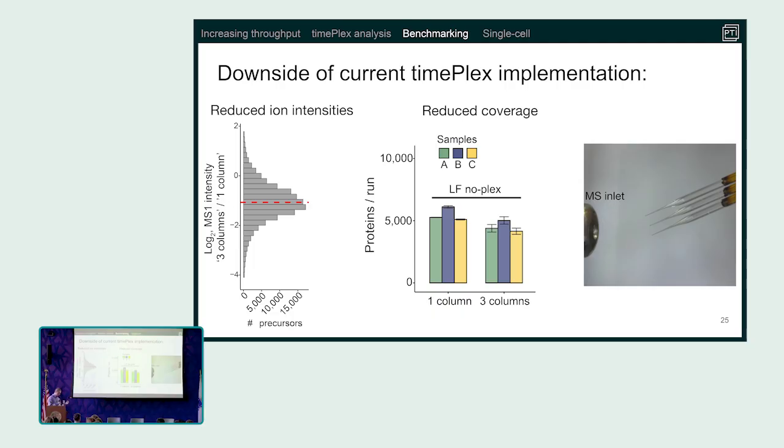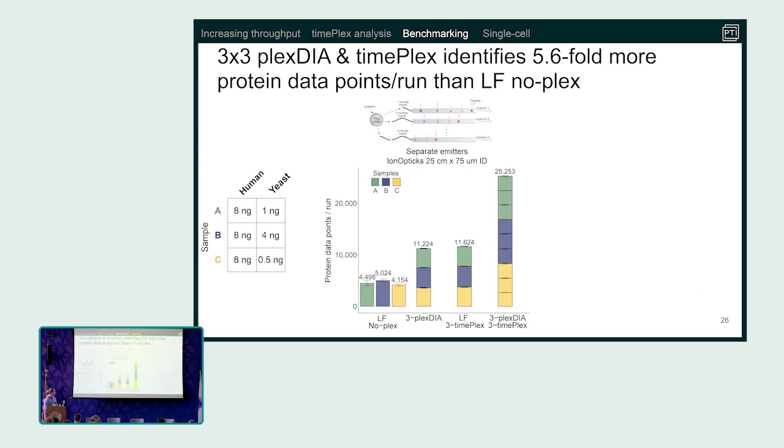So this is the implementation we're going to use. We think that it can definitely improve in the future. And we want to investigate how the data type itself stacks up, assuming that ourselves or others in the community are going to improve this implementation. So we're going to control for the implementation so we can get a look at what the data actually looks like.